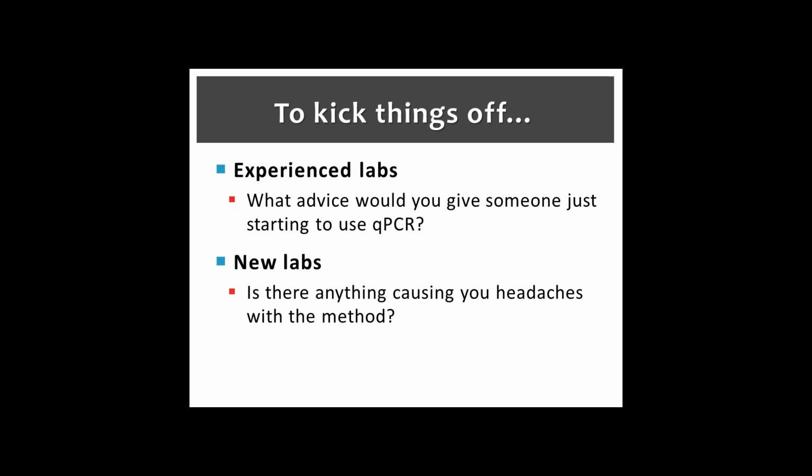At some point, we need to run QPCR on those low samples to get background levels. But then how much background do you need? All of us are working with very limited funding, and you don't want to spend $10,000 on a bunch of zeros. The most exciting samples are going to be the ones where the QPCR went through the roof, and you're like, ooh, I can't wait to run the QPCR on that. So does anybody have an idea of how much background levels you need? Do we have any idea? If not, this is a great question, and we can go back and figure it out.